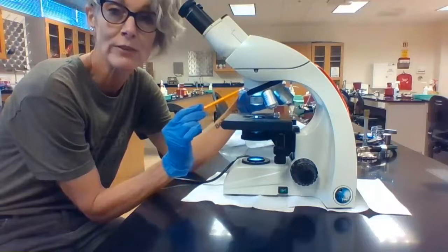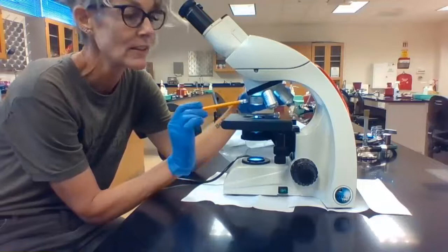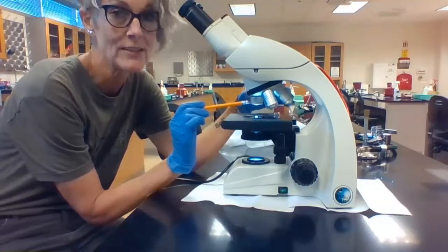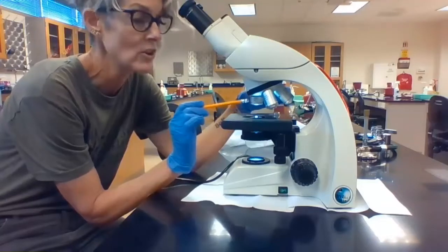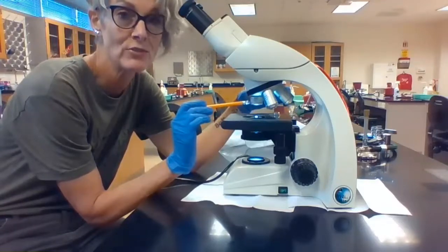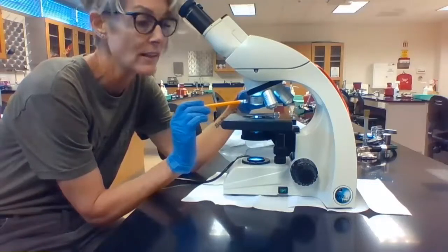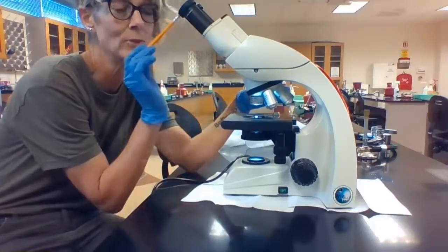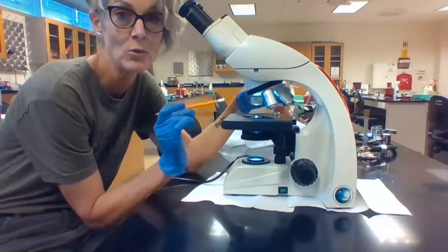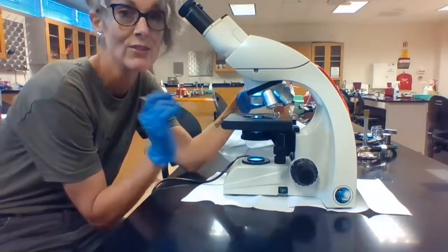This is called the revolving nosepiece. On the revolving nosepiece, we have our objective lenses. This first lens — the smallest lens — has a red band on it. This is where you want to start; this is called the scanning objective lens. It has a magnification of 4x, meaning that it will magnify the sample four times. This lens in combination with the magnification of your ocular lens, which is 10x, gives a total magnification of 40x when viewing a specimen with the scanning objective lens.